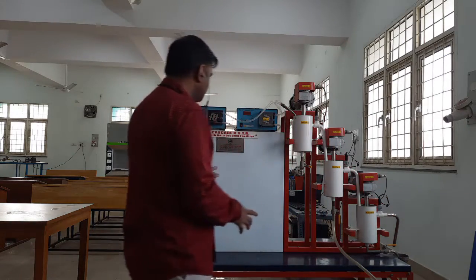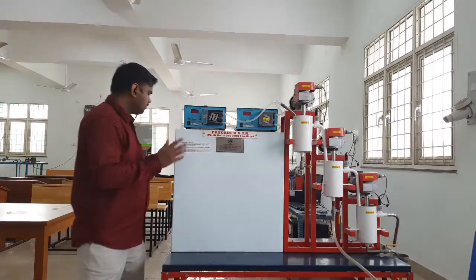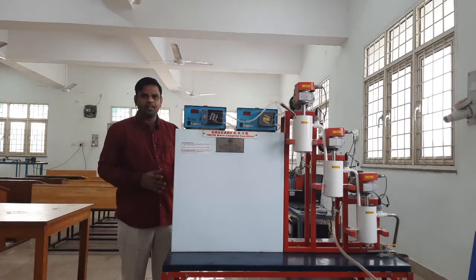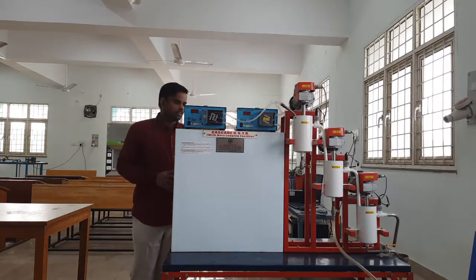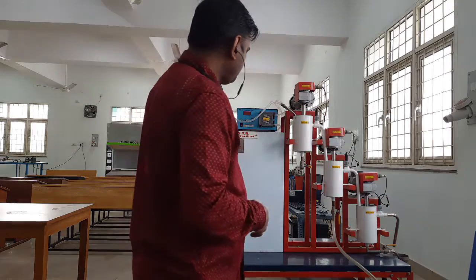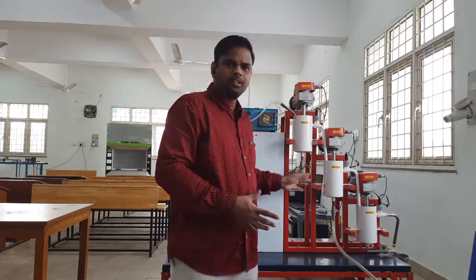Okay, so as we have shown you in the previous laboratory, there are two feed tanks here. So we have feed tank A and feed tank B, where we fill NaOH and ethyl acetate in 0.1 normal solutions. Okay, so this is all about the experimental setup. The chemicals required will be explained by Miss Veena.